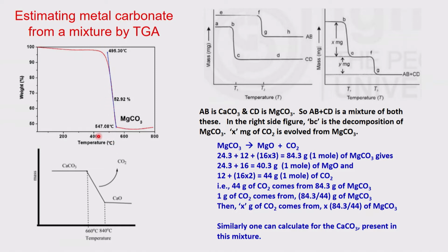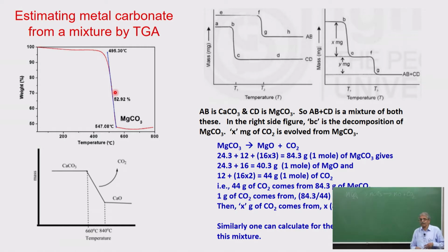around 450 to 550 range. So, around 500 or so. So, they are happening at different temperatures in fact, and the temperature difference is quite far. This is around 750, this is around 500, the difference is 250. That means, if I take a mixture of these two, and even if I go a bit fast in heating rate, still I can separate these two.